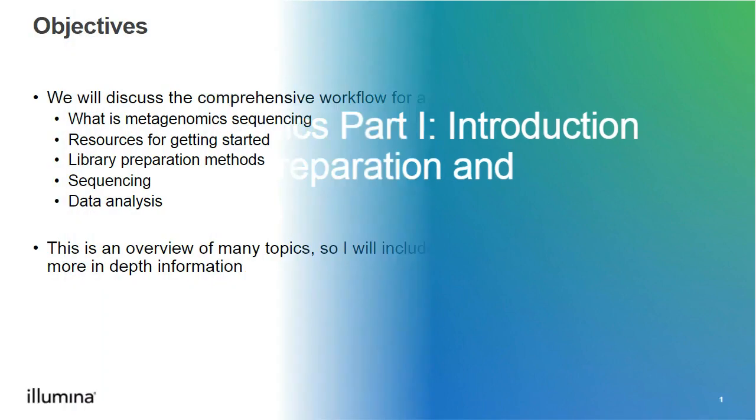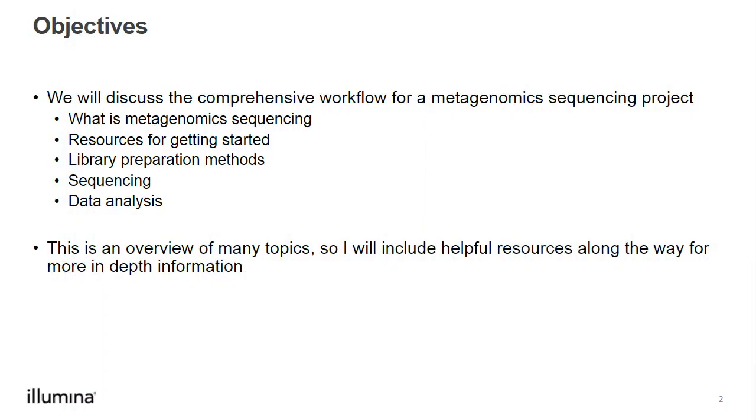We will discuss the comprehensive workflow for a metagenomics sequencing project. This will include what metagenomics sequencing is, resources for getting started, library preparation methods, sequencing, and a brief overview of data analysis. We will discuss many topics here, so I will include some helpful resources along the way for more in-depth information.